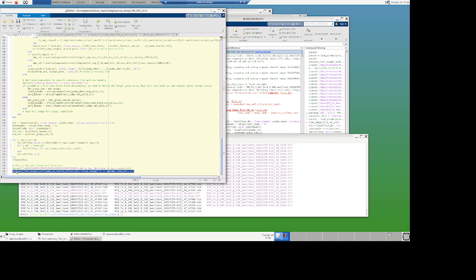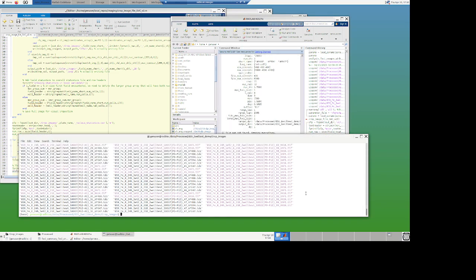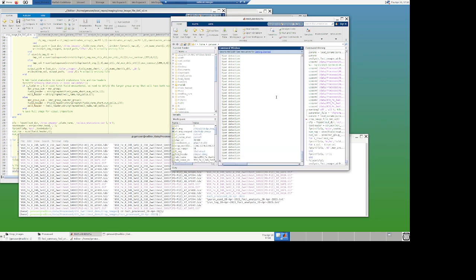So now if I just go like that and do F9, it says QC file was not found, but it's trying to run things. And now if you look again here, I just created a subdirectory that is called something process. It's really annoying why they have this slash here. There must be a mistake somewhere. I gotta change this. So under foci process, you can see the spot detection is taking place right now.